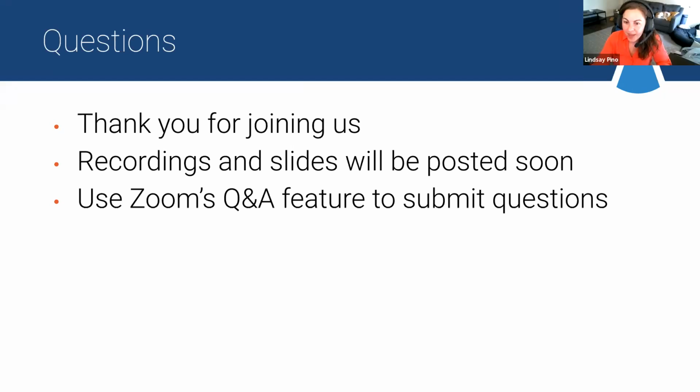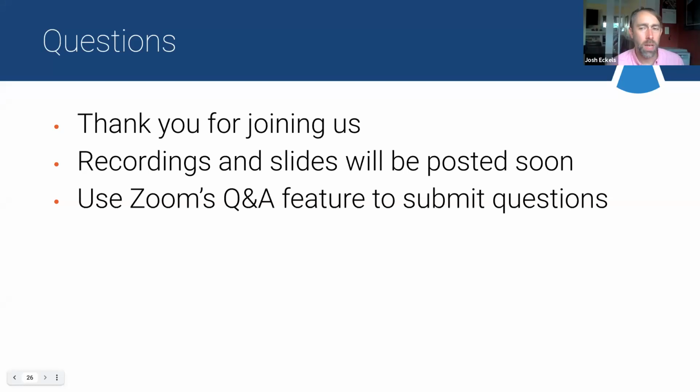Yeah, so we've got a couple questions remaining in the chat here. One of the questions: can I set up a different URL than panoramaweb.org, independent from a folder on Panorama? So it needs to be a Panorama folder. It doesn't need to be one on Panorama Web, though. And I know it could be confusing just in terms of the name.